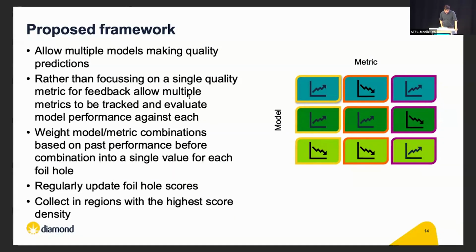And then the other thing is the metric that you're using to assess how your model is performing. We didn't want a single metric, because if you just pick something like the CTF max res, for example, and then you're optimizing for that, there might be a trade-off between CTF max res and the number of picks you're getting, or various other things. If you have data sets with preferred orientation, you might care more about whether you're seeing a certain view or not.